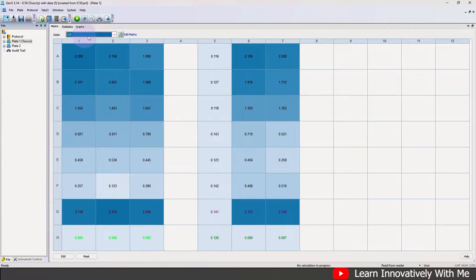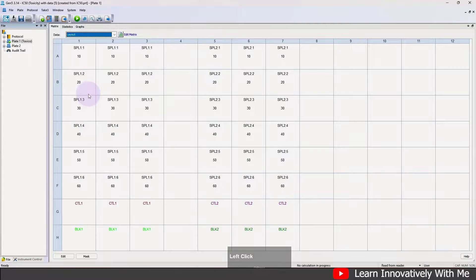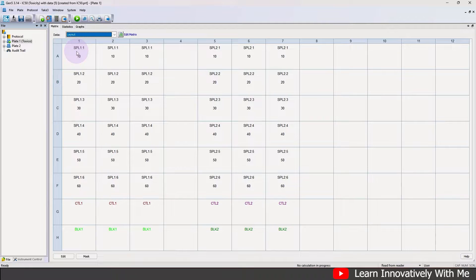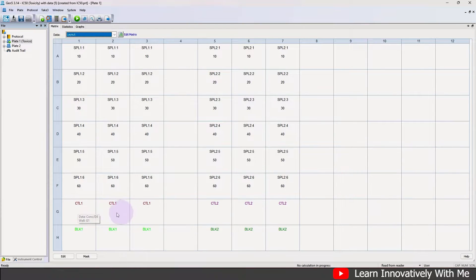Here is plate 1 data with absorbance at 620nm. If you click here and select the plate layout, in the plate we have two types of sample — sample 1 and sample 2 — with dilutions 10, 20, 30, 40, 50, 60 in triplicate, along with a positive control and a blank for both sample types.